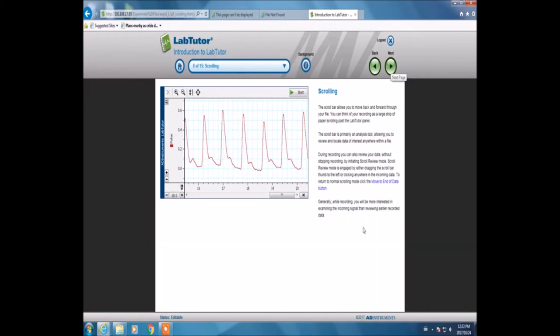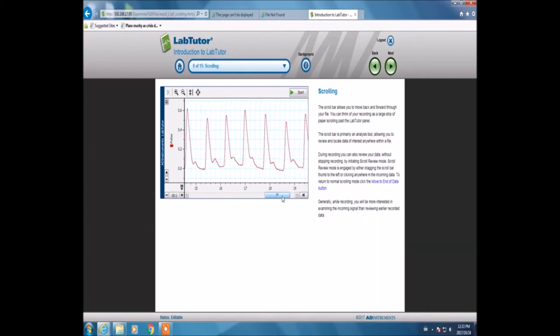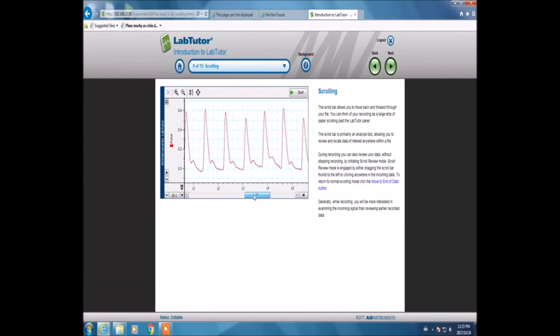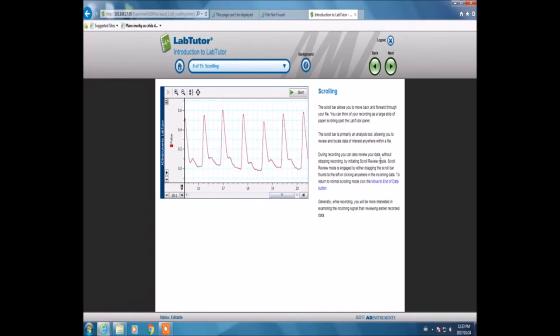Now we're at the scrolling panel, learning how to use the scroll. You can scroll backwards and forwards. Scrolling gives you an option to look at your data.